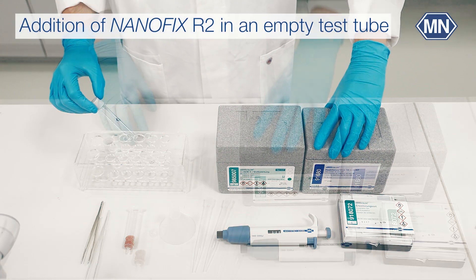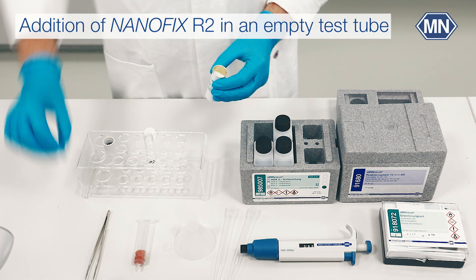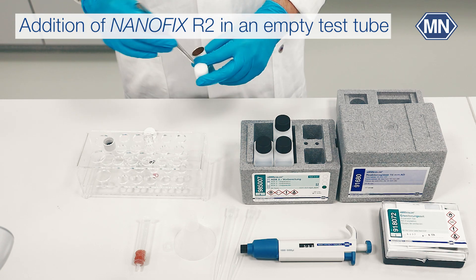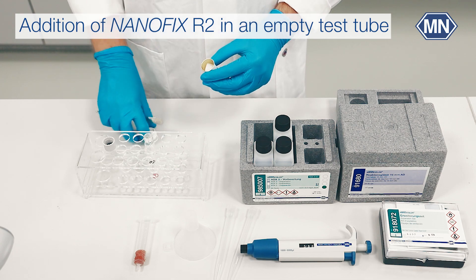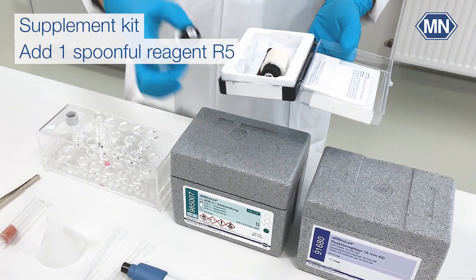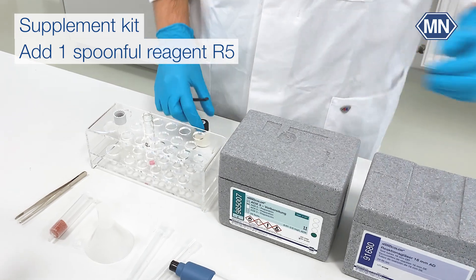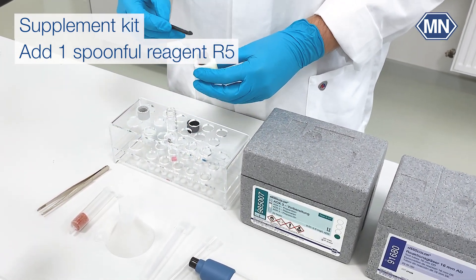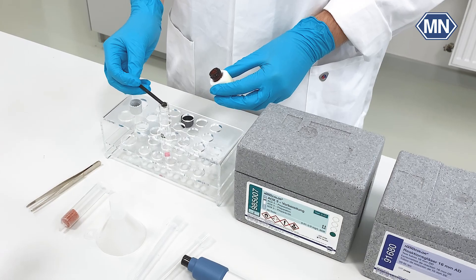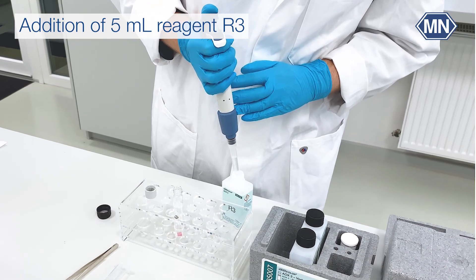To get started, we take an empty test tube and add a Nanofix R2. If you are using the supplement kit, add a level spoonful of reagent R5 with a black spoon. Then add 5 ml reagent R3 from the preparation set and shake the test tube carefully.